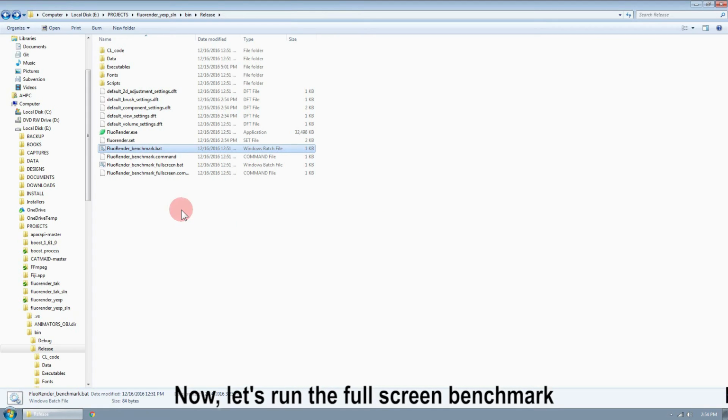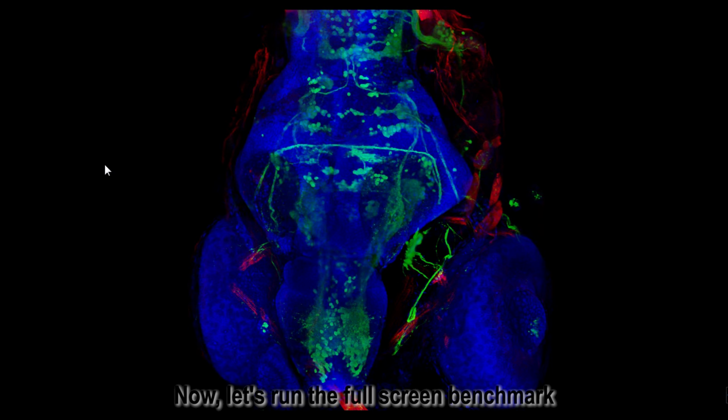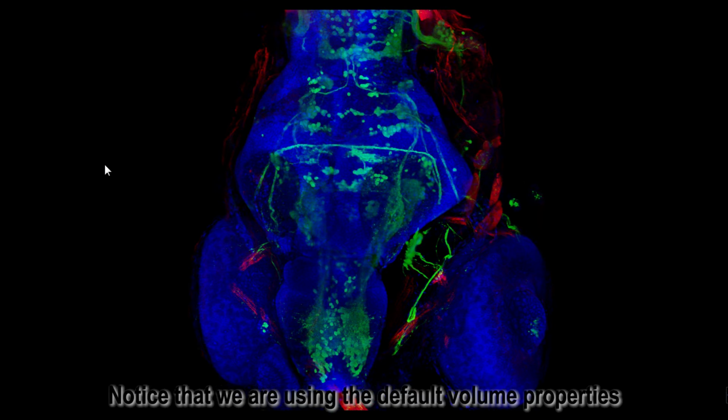Now, let's run the full screen benchmark. You will see a still image, although FluoRender keeps refreshing it. Don't rotate or move the rendered image. Notice that we are using the default volume properties.